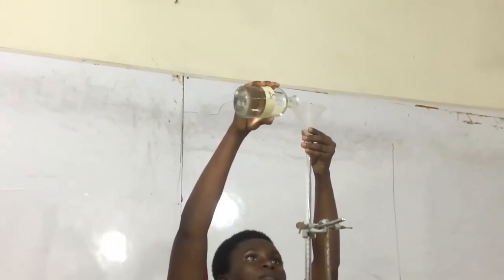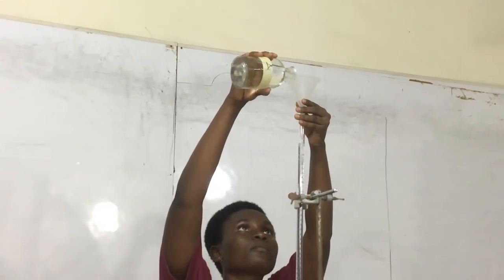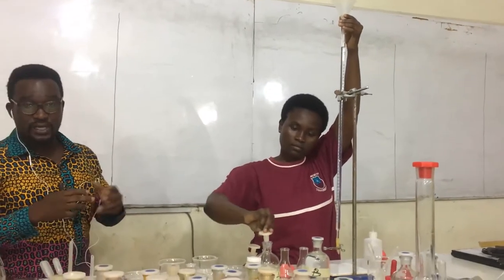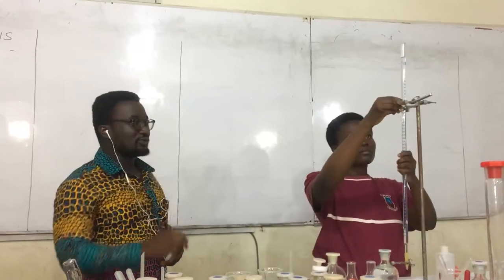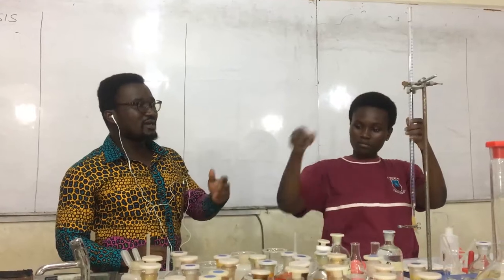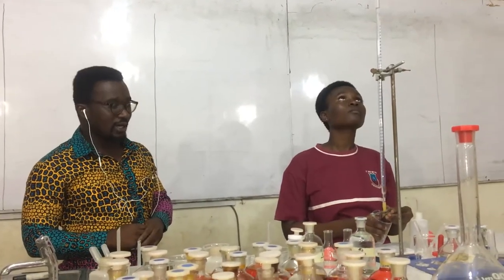So quickly, I realized that she has picked the reagent bottle labeled A because of the instructions from the question. And then she has transferred it into the burette.